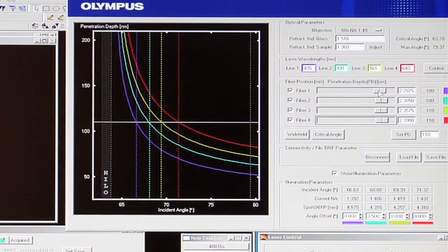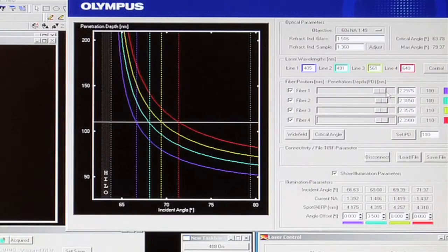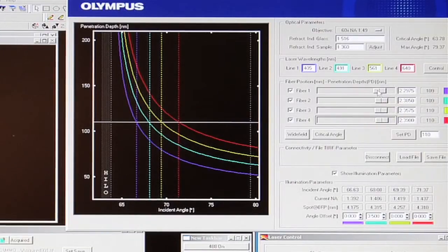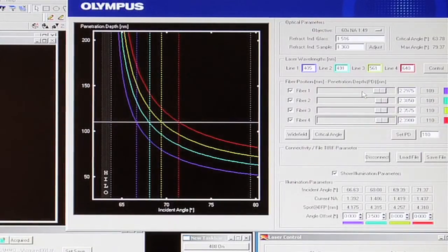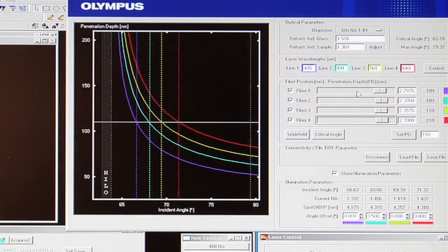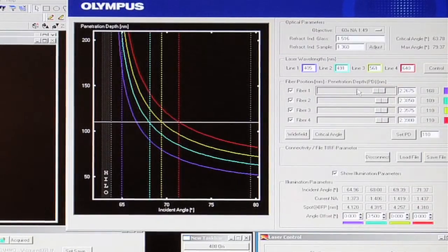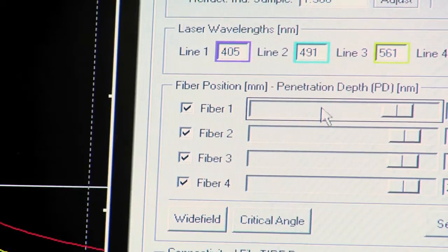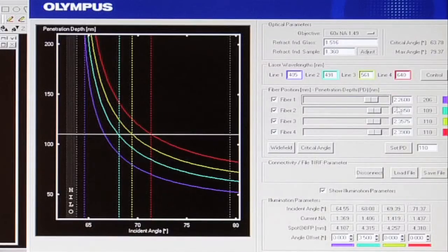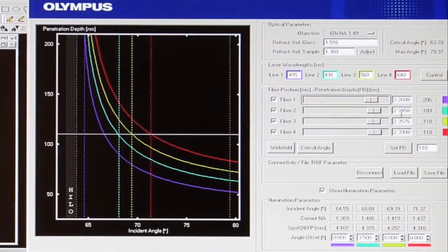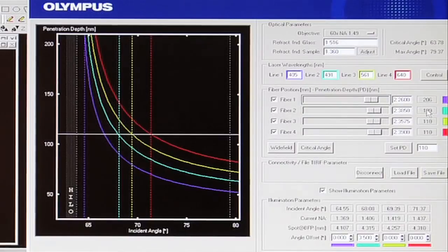Each of the wavelengths is then, each of the fibers is then controlled individually by sliders. On the previous systems, we used the micrometers. Now it's all done with stepper motors via sliders. So we can click and drag in here to adjust, to make small adjustments. We can maybe use the mouse wheel to make faster adjustments. And we're reading out here the position of the optical fiber, which is actually here on the illuminator. And then the calculated penetration depth here, which is what we're interested in for TIRF. So this number here reading out is in nanometers.